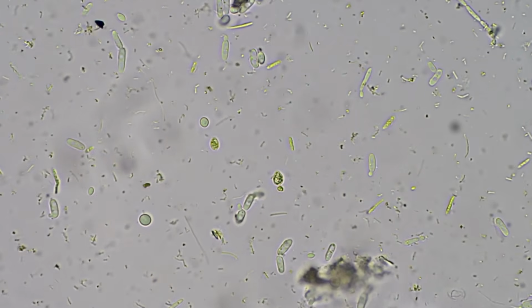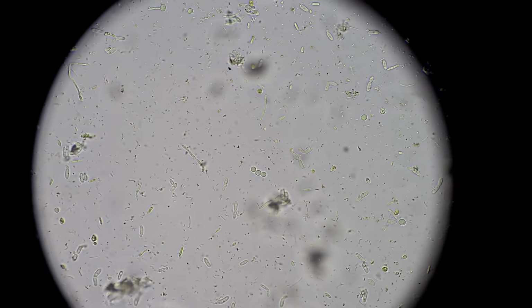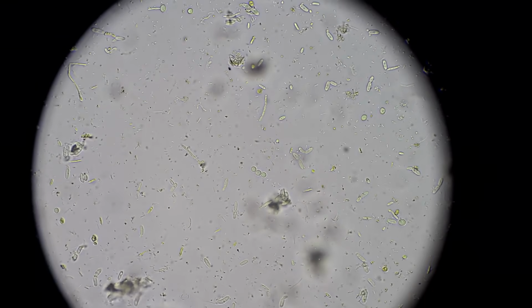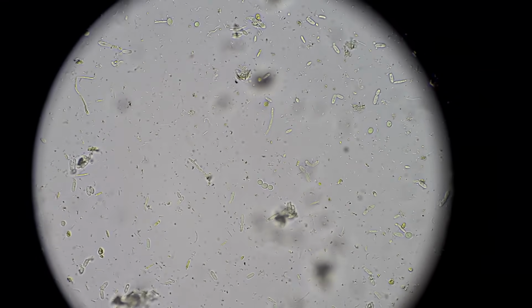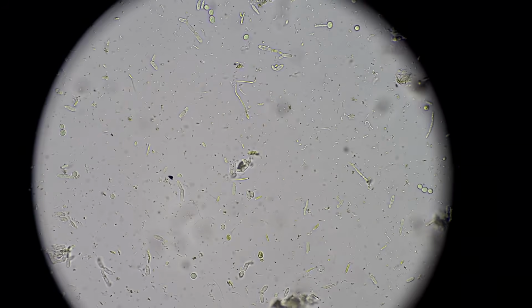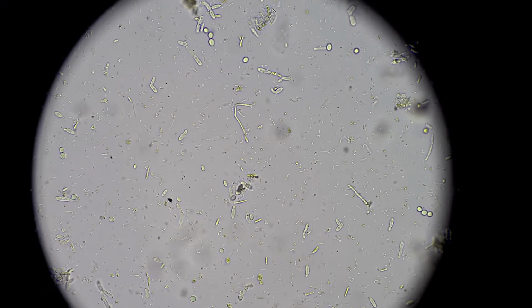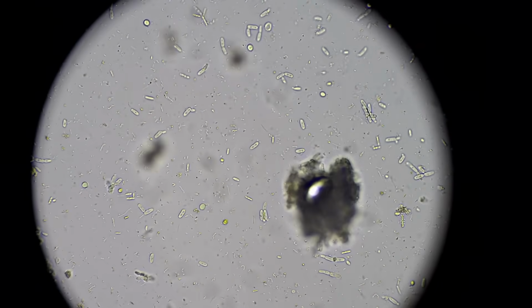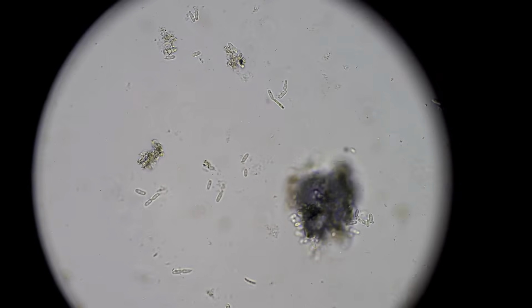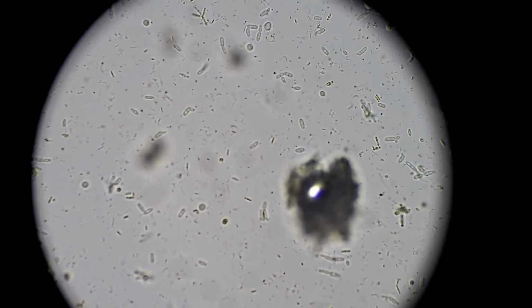All right. And then the big fat ones that are ovals and long, like baguette shaped, those are yeast, and you can see them reproducing. They're happy. You can also see just by the shapes of them and the insides of them that they're yeast. So this is looking good. Here's another yeast flake right here. This is exactly what we want to see in our EM.